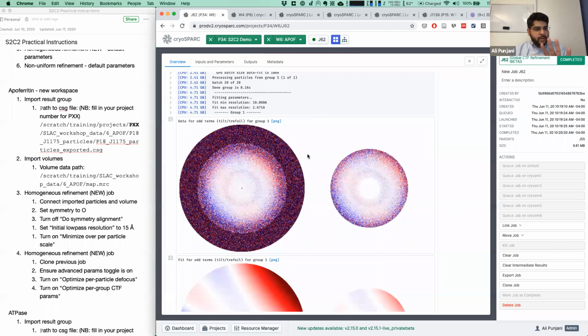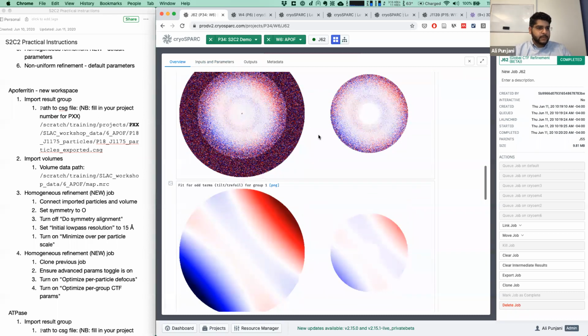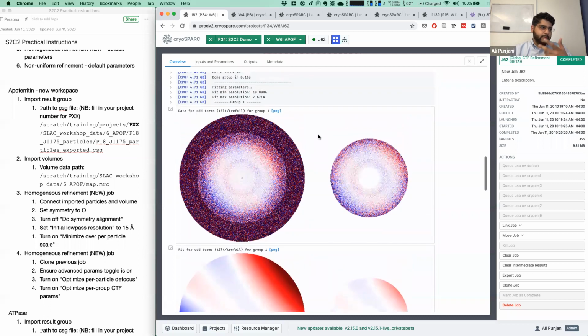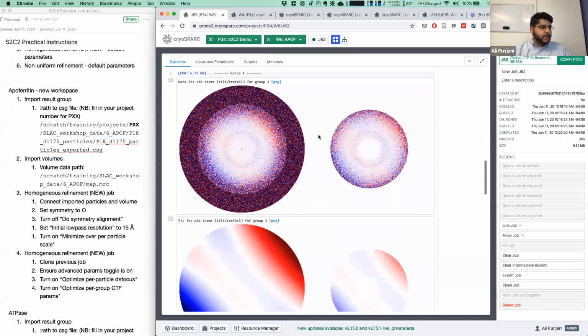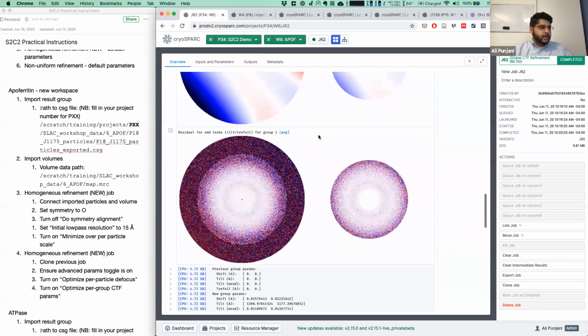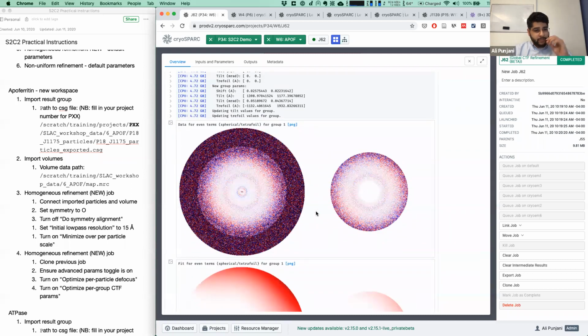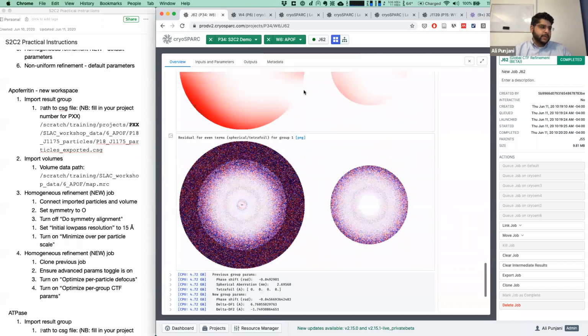So there are 4 different kinds of aberrations that we can estimate and correct for in CryoSPARC: beam tilt and trefoil, which are both odd first and third order aberrations. We can also correct for spherical aberration. We can re-estimate the spherical aberration and correct for tetrafoil, which are both 4th order aberrations. So this data set is not a great example.